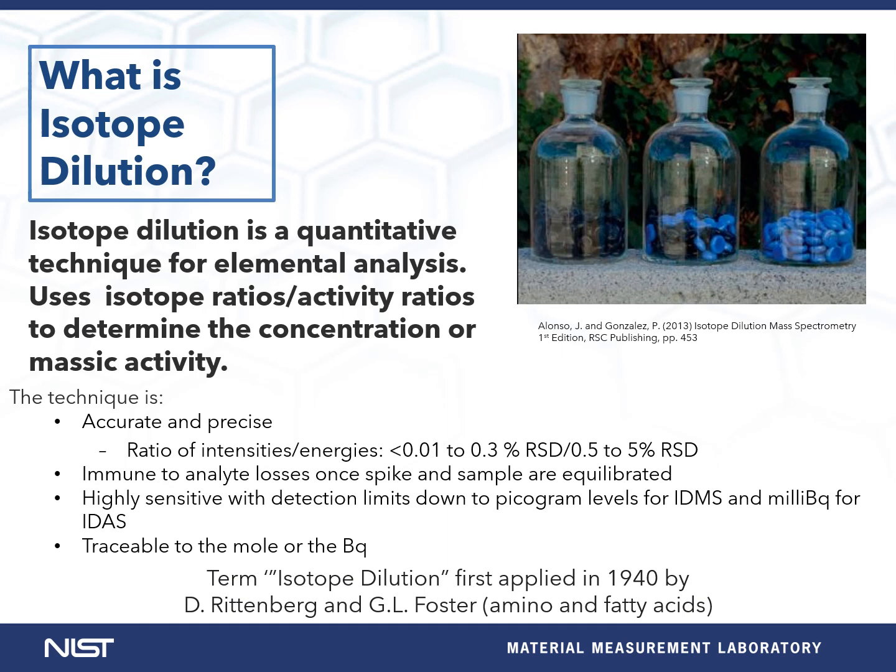Three, it is a very sensitive technique with detection limits down to sub-picogram levels for isotope dilution mass spectrometry or IDMS and millibecquerels for isotope dilution alpha spectrometry or IDAS. Four, it is traceable to SI units, the mole in the case of IDMS and the becquerel for IDAS.